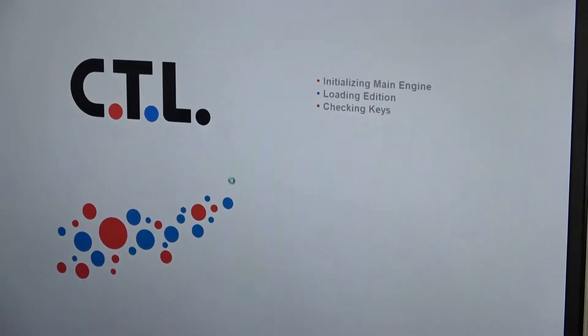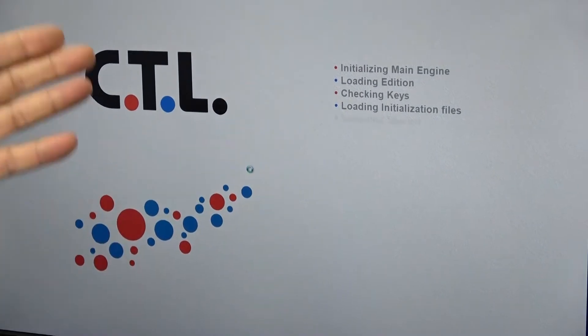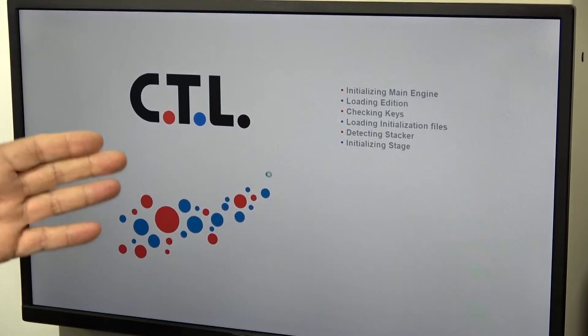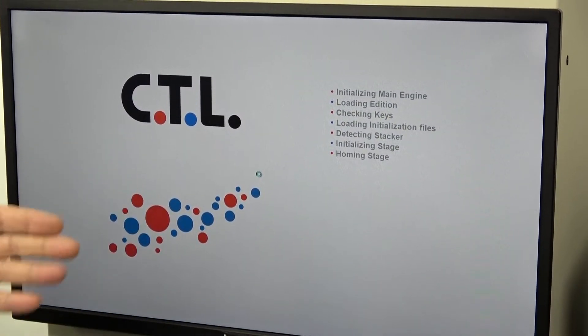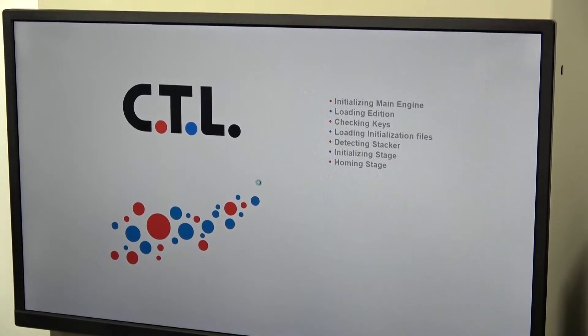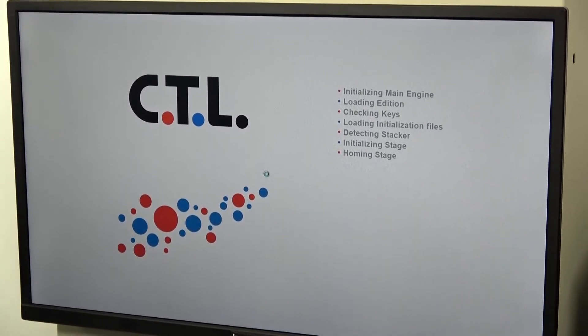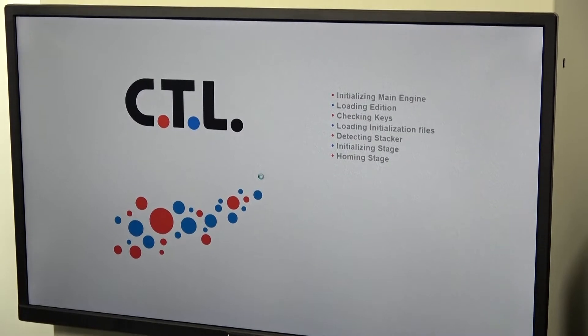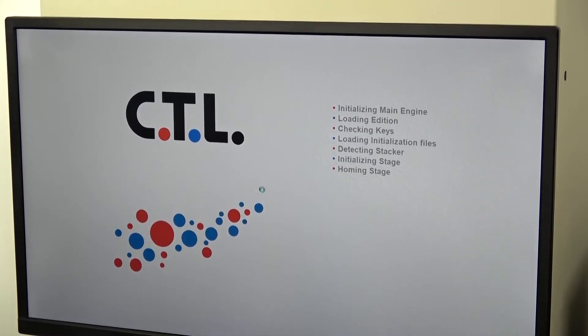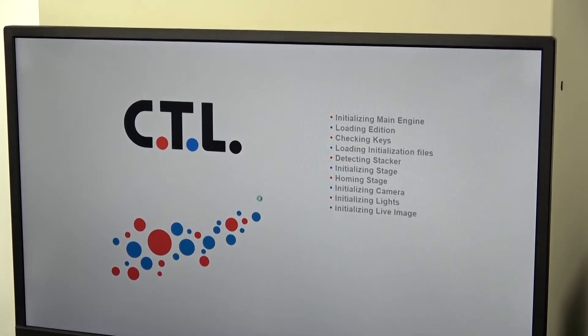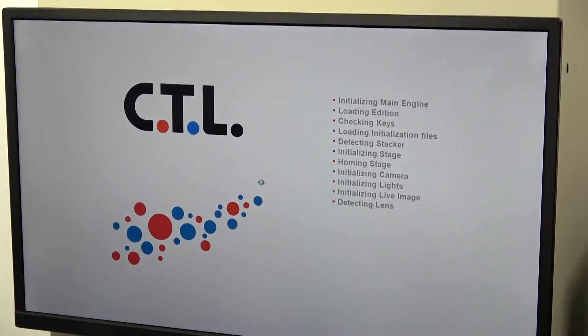Some of our testing is to make sure the software runs, of course, that it initializes the unit entirely, including initializing and homing all the motors, in this case a stage, the autofocus, the lens control software is all initializing.